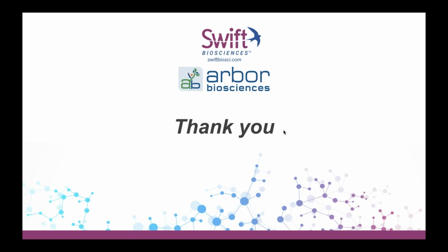We haven't actually done ribodepletion into a library into a high capture. And it's my intuition, though, that because of how many library molecules you're producing before you go into high capture, depleting before might not actually have that big of an impact. And so by adding the extra 2 hours of ribodepletion, you have a very minimal impact on your final library. It's a trade-off, but it's not something we have tested. But it's my intuition that it might not improve that much.